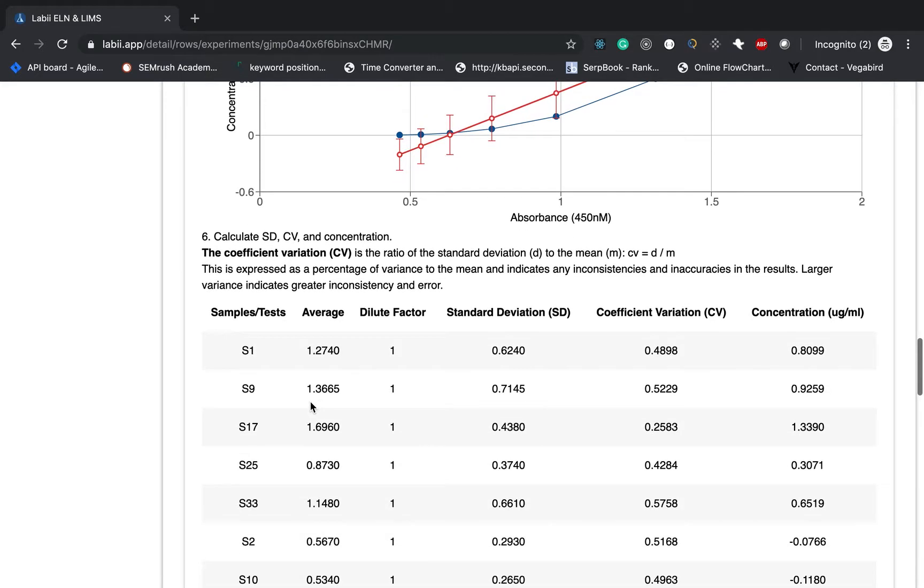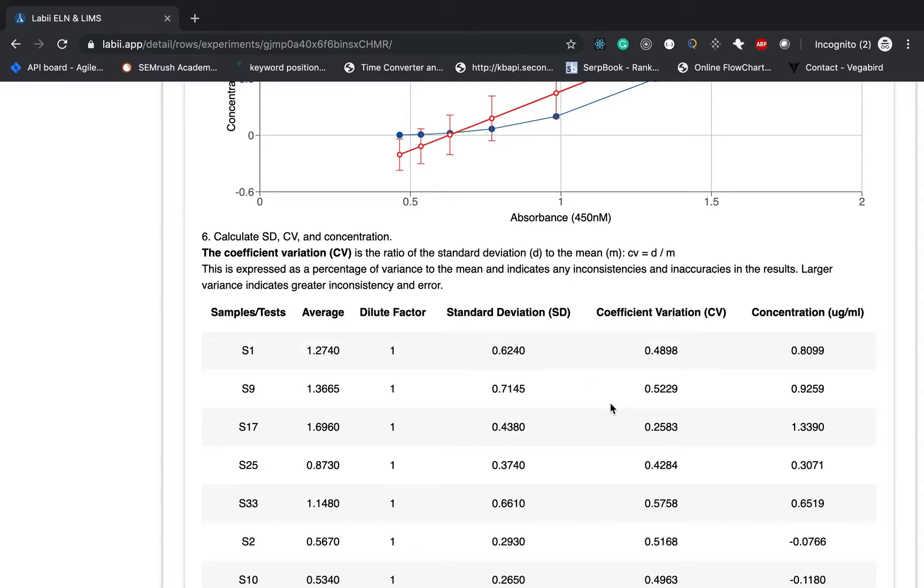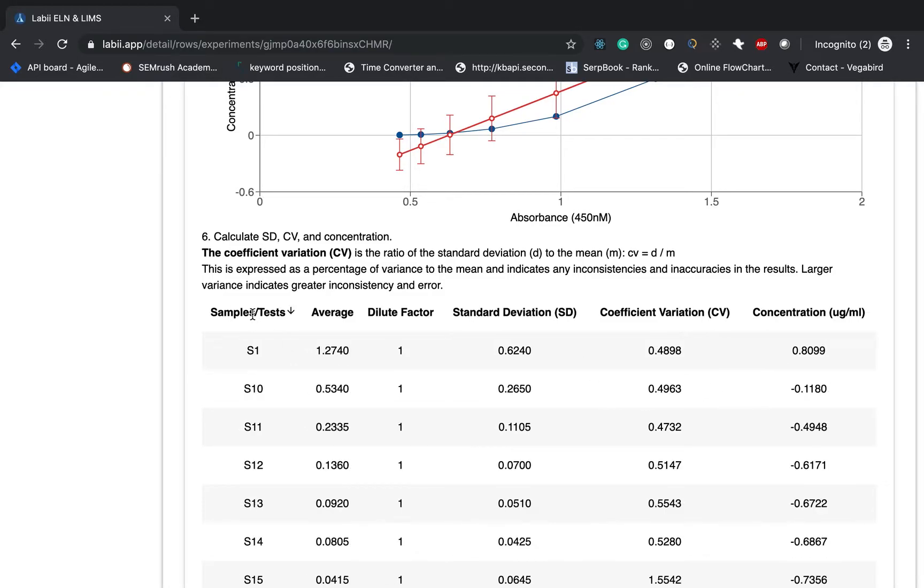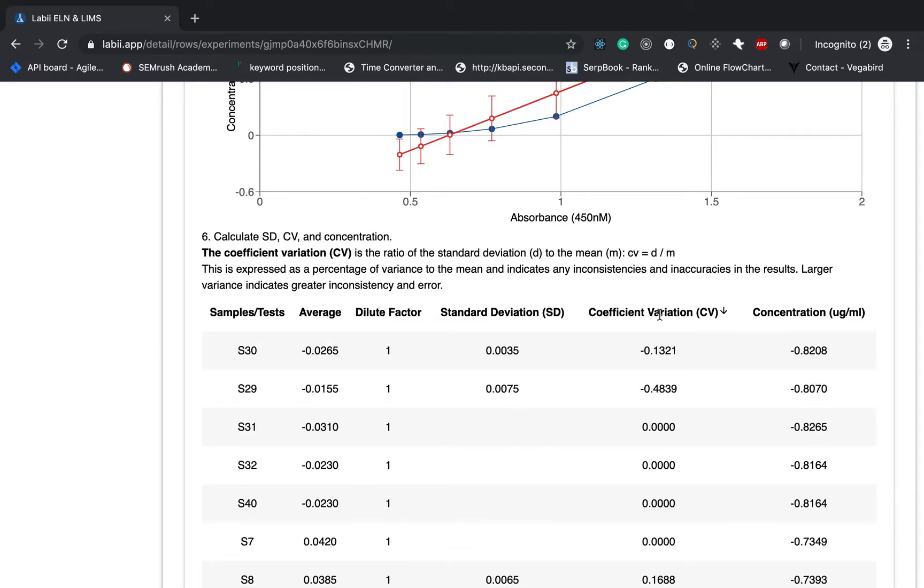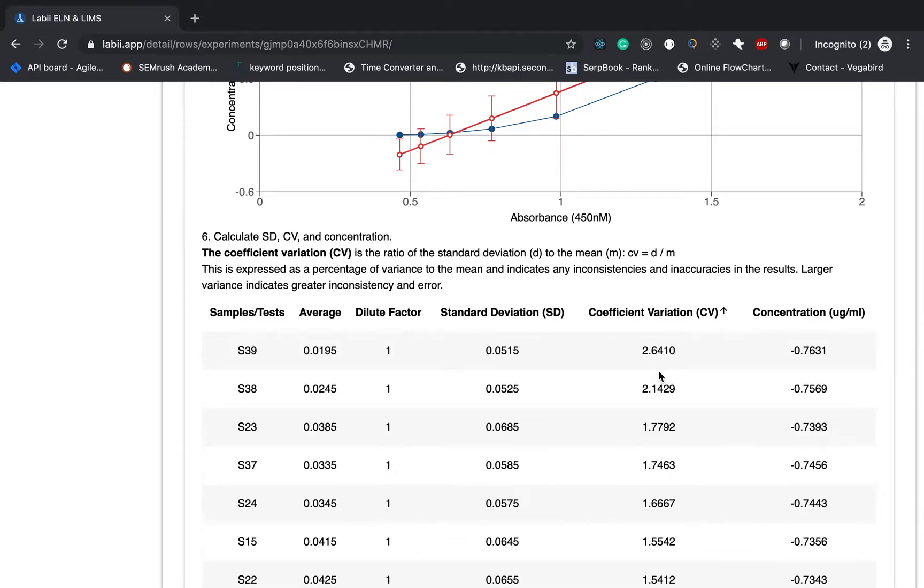Finally, calculate the SD, CV, the concentration. This table will give you all the samples, the average value, dilute factor, standard deviation, CV, and final concentration. You can always click the title to sort it. For example, you can always find the one with the higher CV. Coming back, one thing we do notice is the standard curve does not fit to the standard very well.